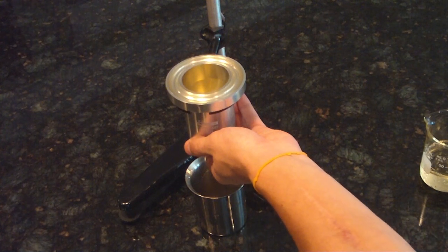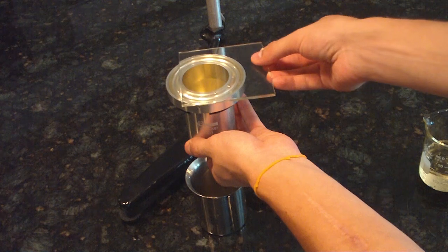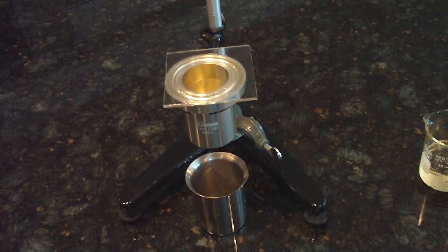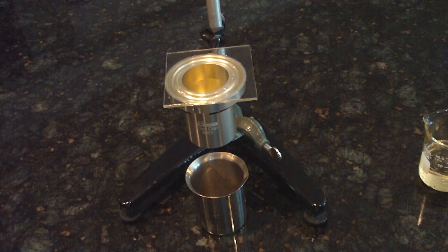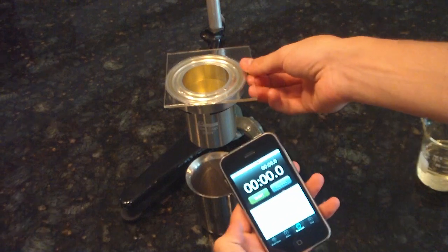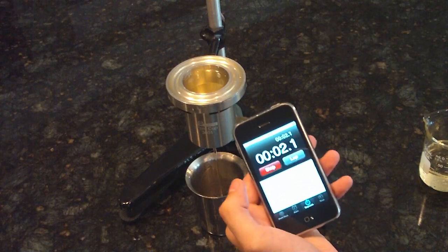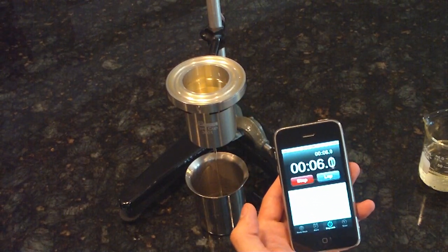Then you place the glass plate over the top. At the same time you remove the glass plate and start a timer simultaneously — let it flow through the cup. You stop the timer as soon as the flow has any break in it.